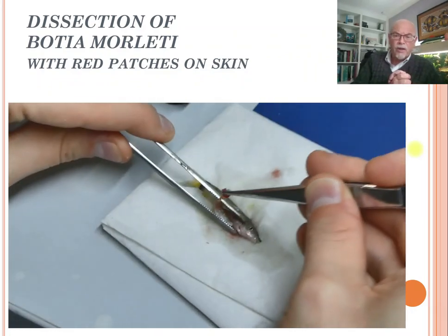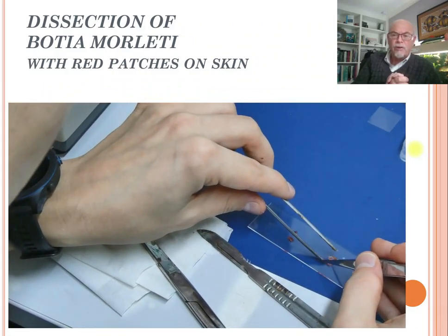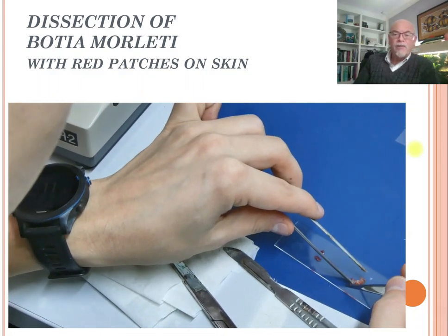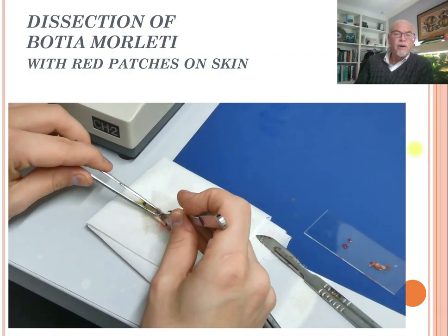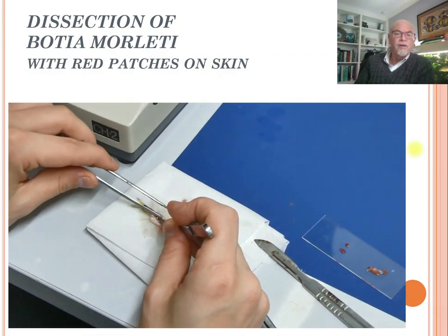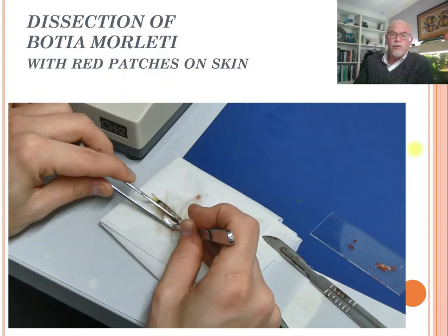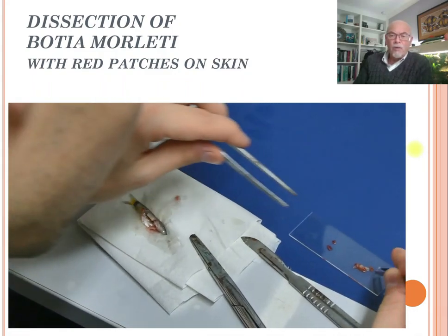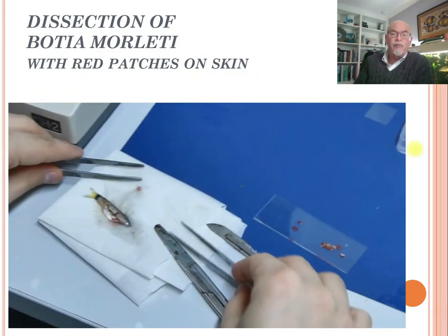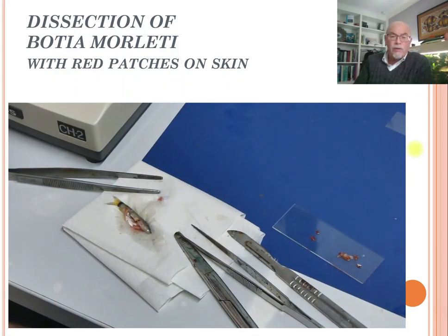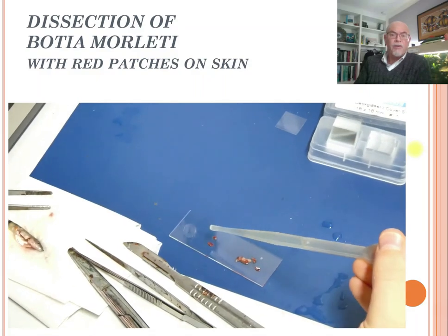He's now taking out the different organs — here he takes away the intestine and the spleen, which is attached to it. You can see the redness there. He also takes a part of the liver sample. With those five examinations — skin, gill, liver, spleen, and intestine — we can find most of the problems. This is simple: we don't use any coloring techniques, just raw pathology. We call it field dissection, field microscopy, and anyone can do it — it just takes practice.